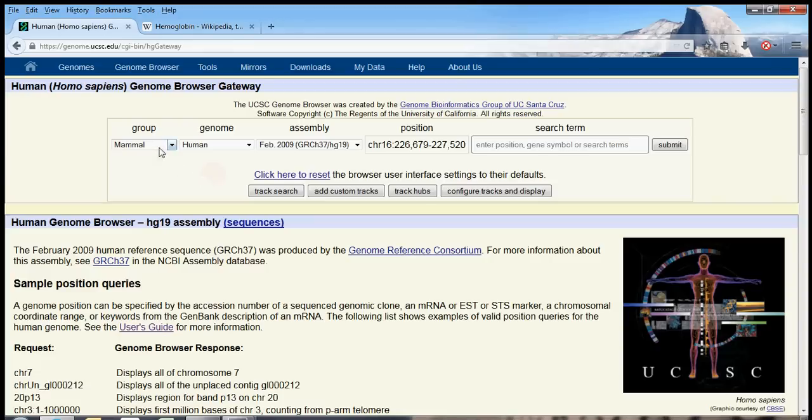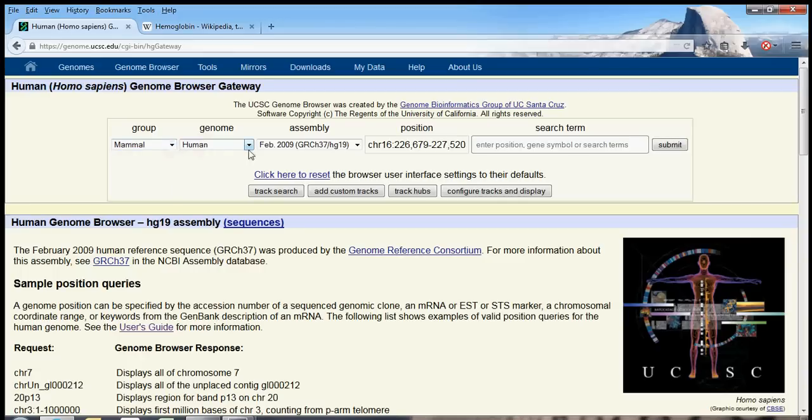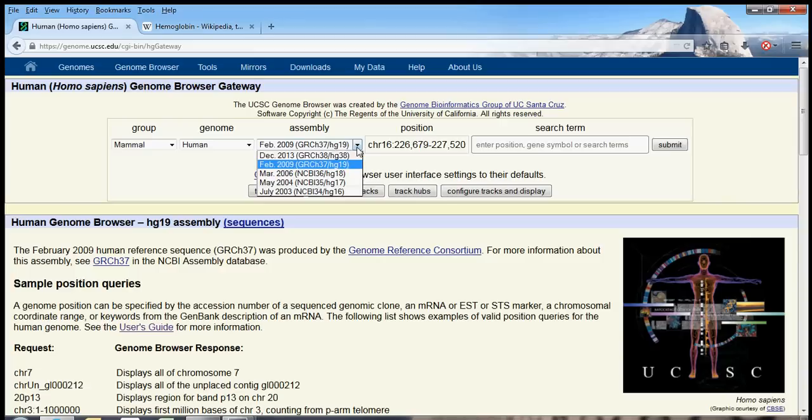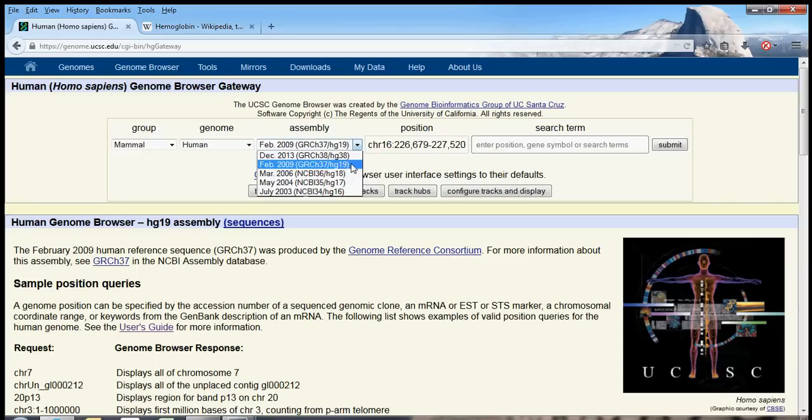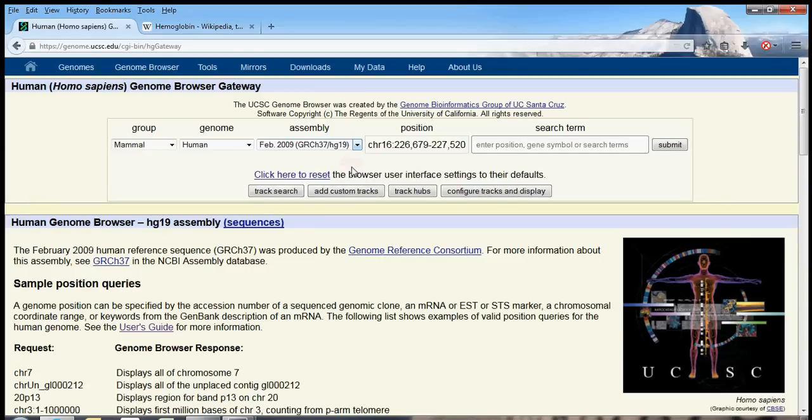So obviously, we want the human genome, which are mammals, not insects. And furthermore, we need to pick the appropriate assembly. Now, over the years, our knowledge of the human genome has gotten more and more refined, and as a result, our assemblies have gotten more accurate. These days, a lot of researchers are still relying on the 2009 assembly, HG, Human Genome 19. So let's stick with that.